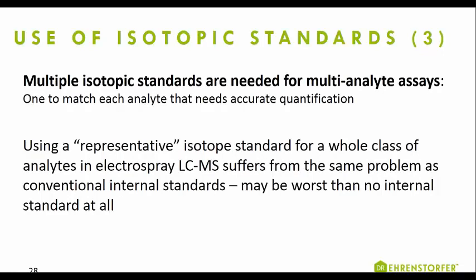And finally, remember that for LCMS matrix effects, the internal standard is only applicable to its own matching analyte. Be very careful about using one representative internal standard to cover a whole class of analytes. I know that this compromise is inevitable.